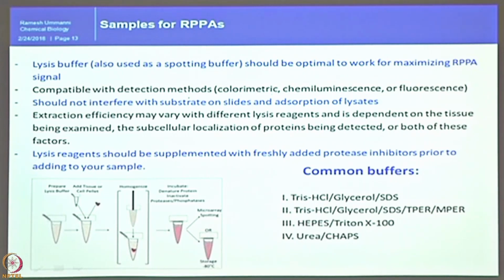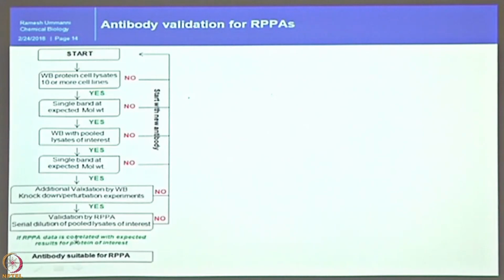So, there is no hard and fast rule that a teacher explained this concentration and it will work or it will not work. So, you have to optimize, please keep this in mind. Then the second point highlighted was the essential requirement of good quality antibodies.